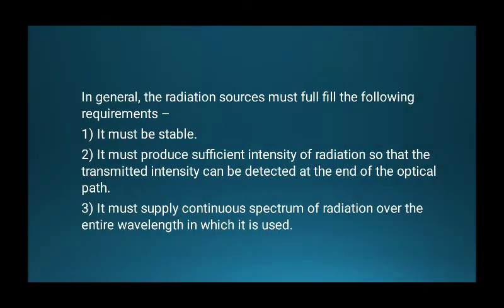In general, the radiation source must fulfill the following requirements. It must be stable. It must produce sufficient intensity of radiation so that the transmitted intensity can be detected at the end of the optical path. It must supply a continuous spectrum of radiation over the entire wavelength range in which it is used.